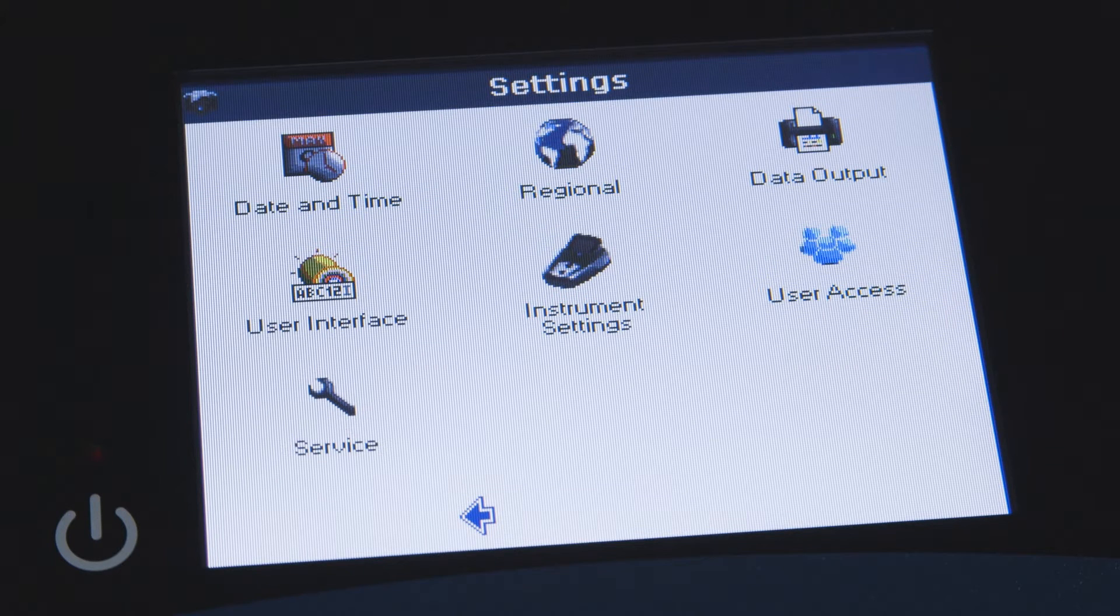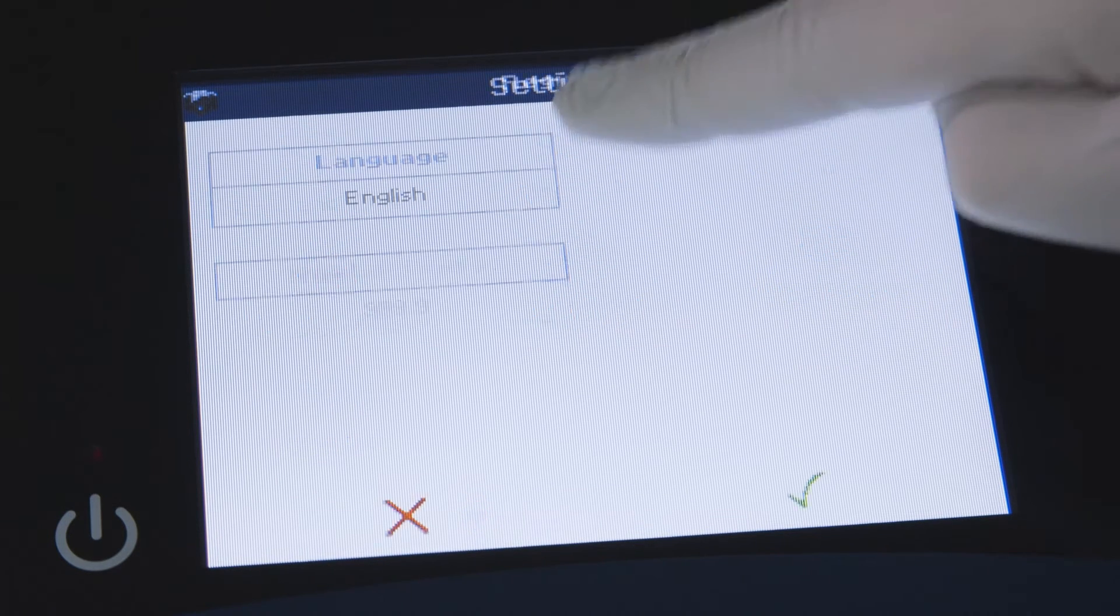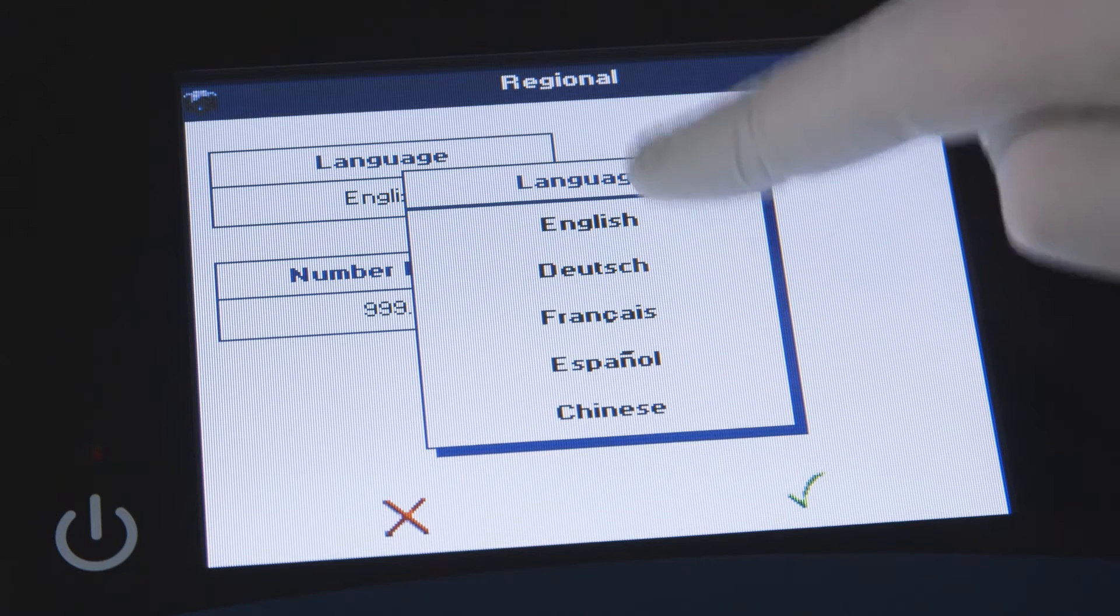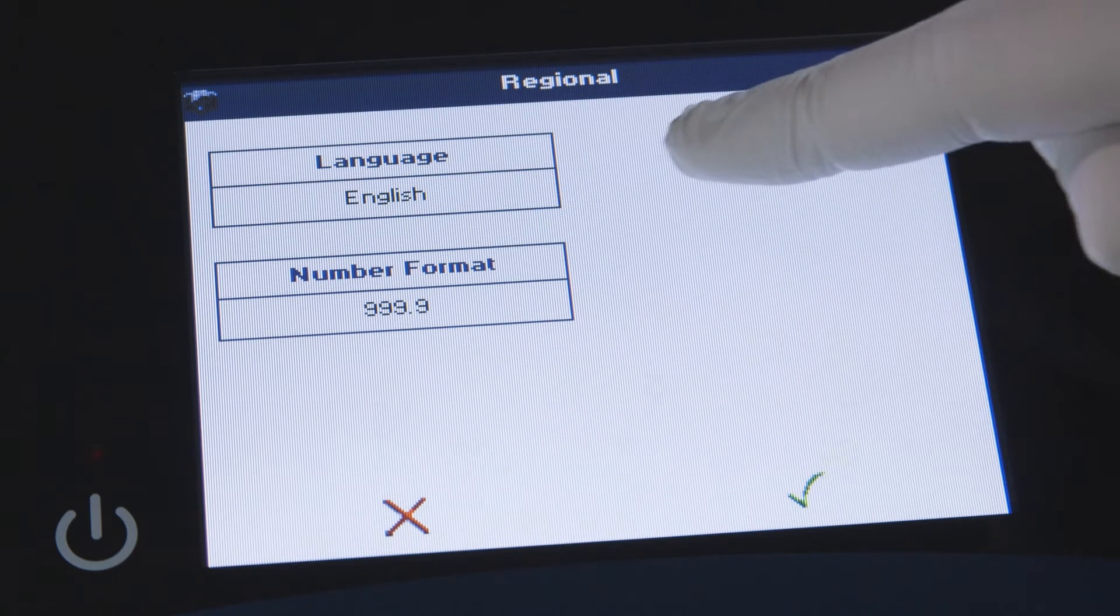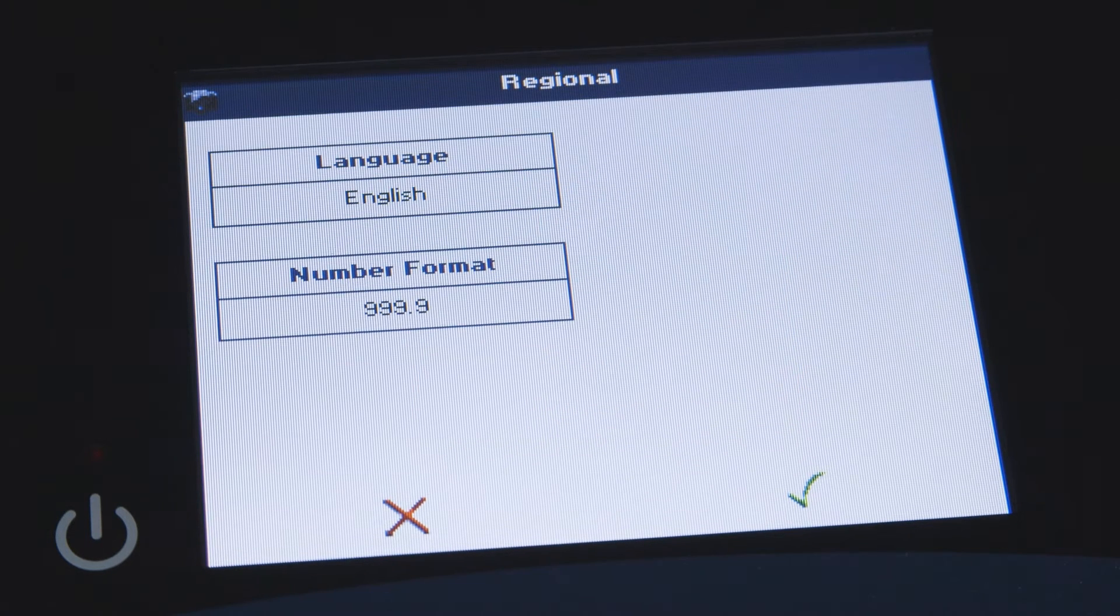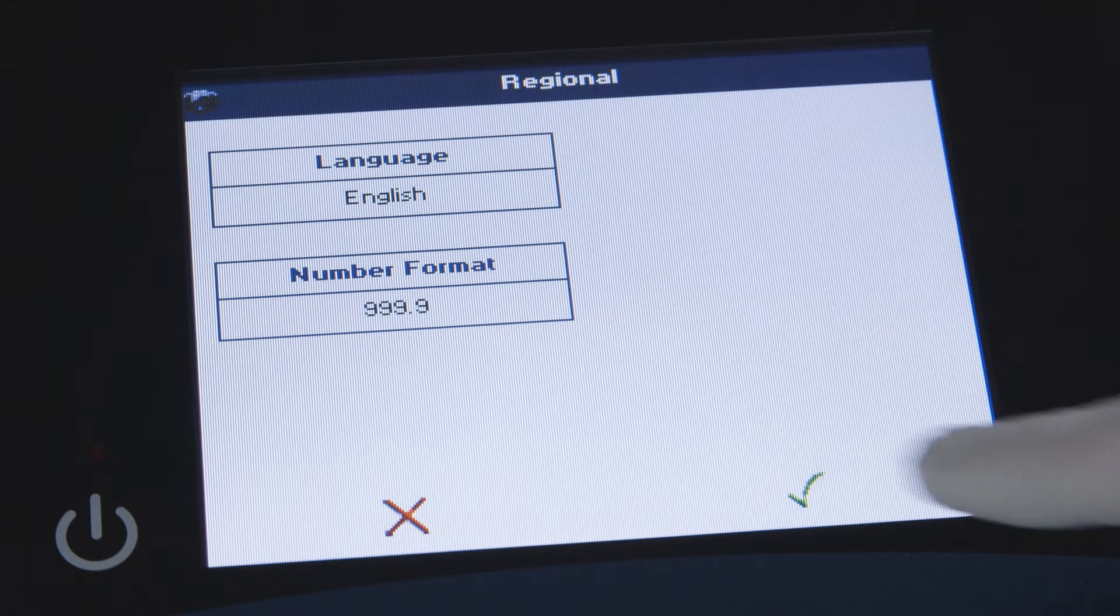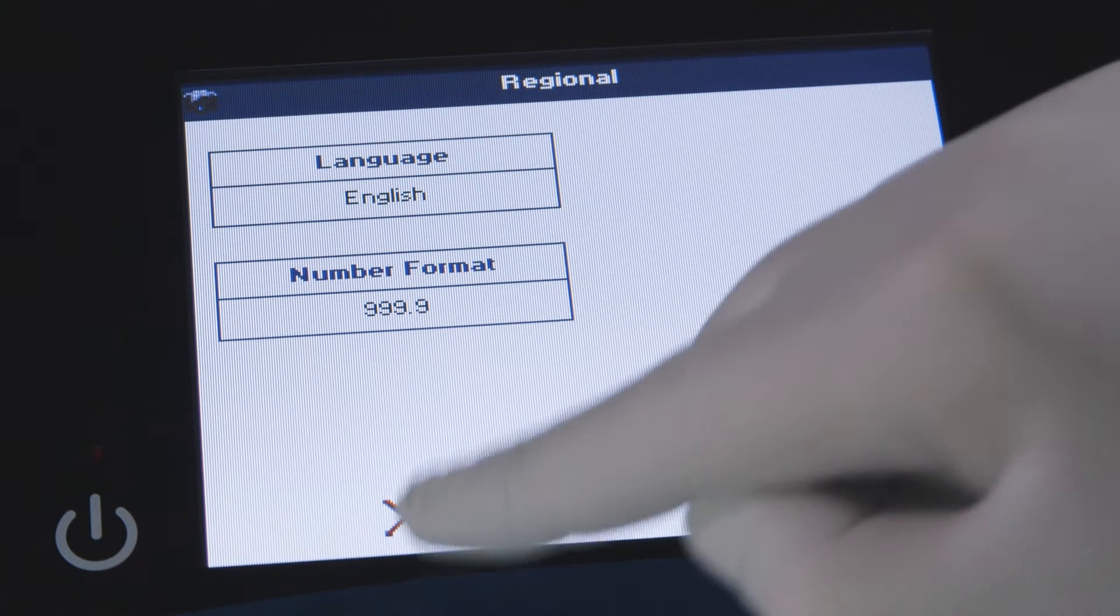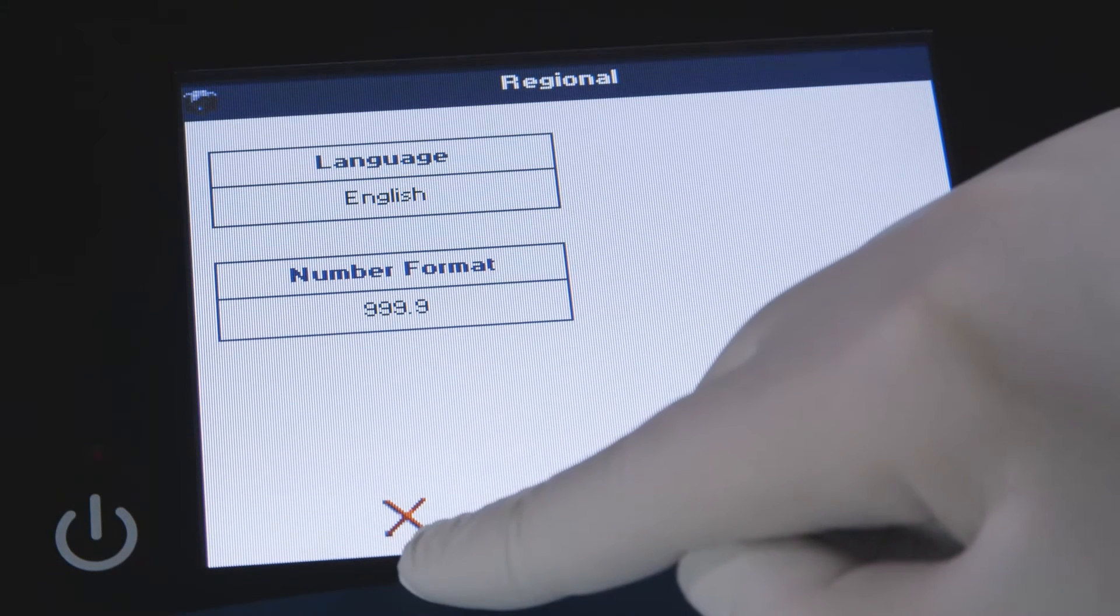The language can be changed by touching regional, then touching the language box, then touching a different language option from the list. To save your change, touch the check mark. To exit without saving, touch the X.